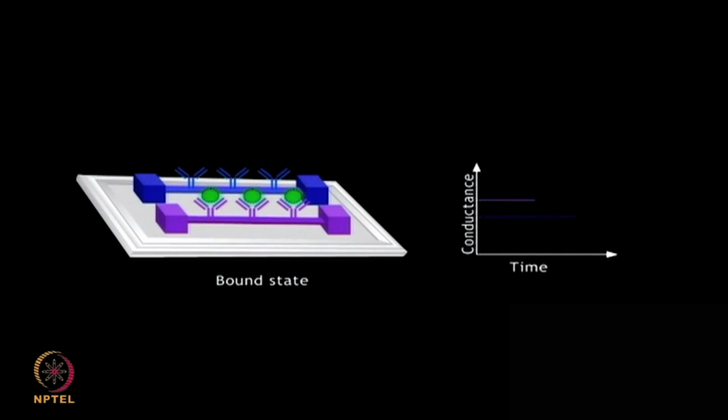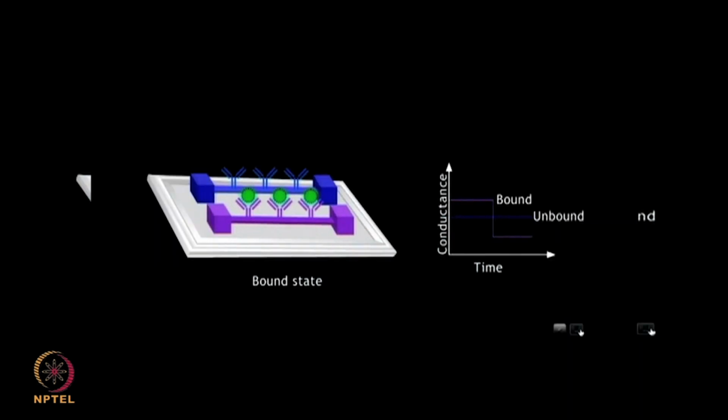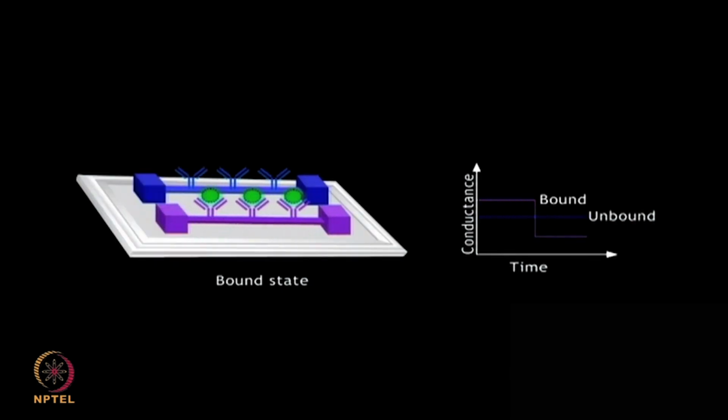These devices offer excellent sensitivity in the picomolar to femtomolar range and are capable of detecting molecules even at single particle level.